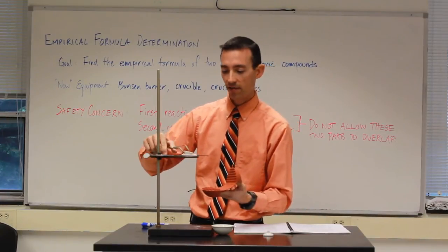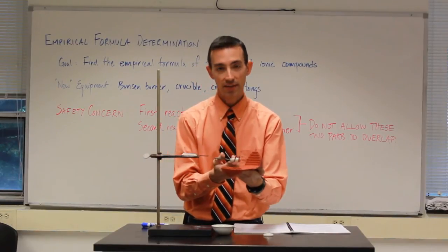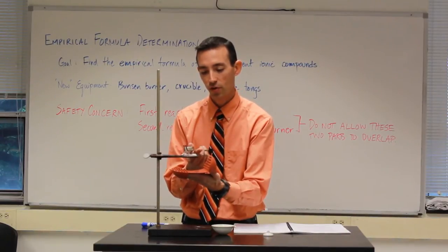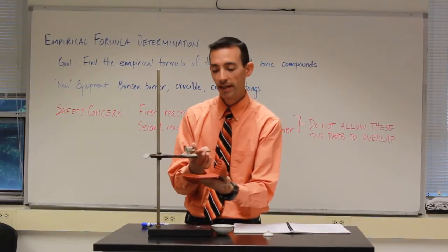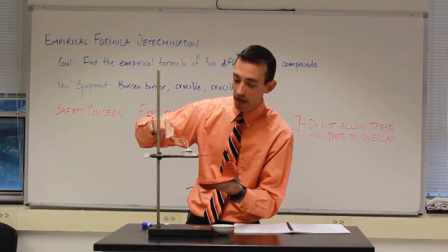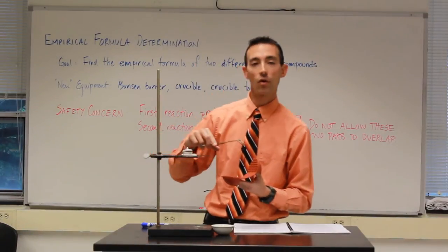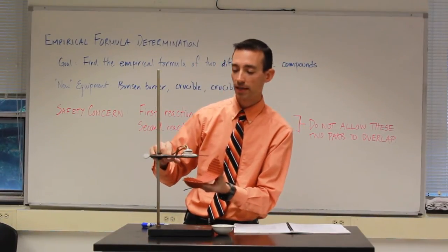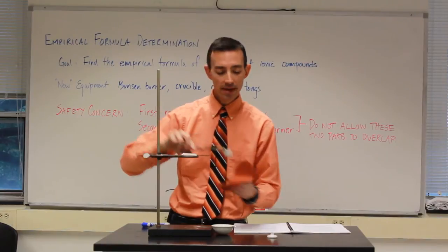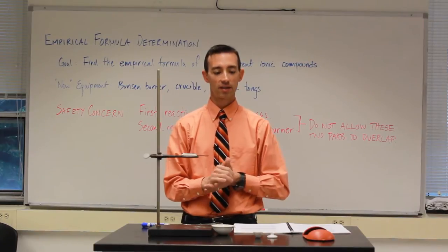With either method of pinching there or carefully squeezing, notice that I'm going to support so that if anything were to drop, it would fall right onto my hot hands. This is a pretty safe and secure method for moving your crucible in and out of the clay triangle. And then the lid would be placed on top as well. And the lid needs to be ajar when we're using the crucible, just like the lid on a pot. You don't often put the pot securely on if you're going to be boiling the contents of the pot. If you break your crucible, it is not the end of the world, so to speak. We do have extras, and just please ask your instructor for a new one.